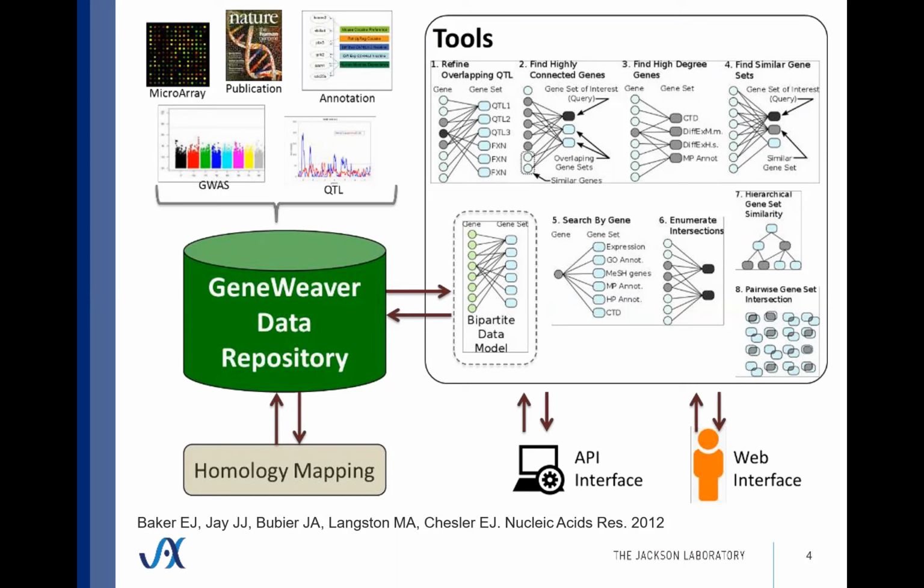And so you may have a question that says, well, how do I refine? I have many overlapping QTLs from rat studies of addiction-related behaviors and physiological response to drugs and behavioral response to drugs, and maybe even some non-addiction related behaviors. How do these QTLs relate to one another? And if I look at their overlap, can I find one gene or variant that's associated with all of them or a subset of them? So we could take lots of data.